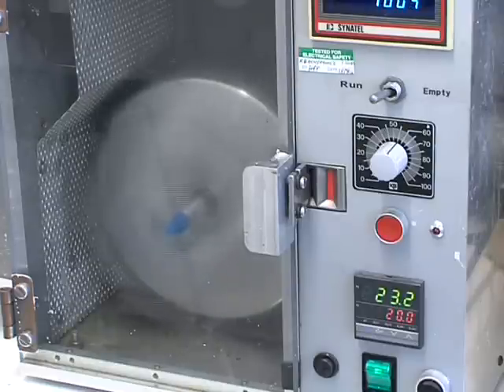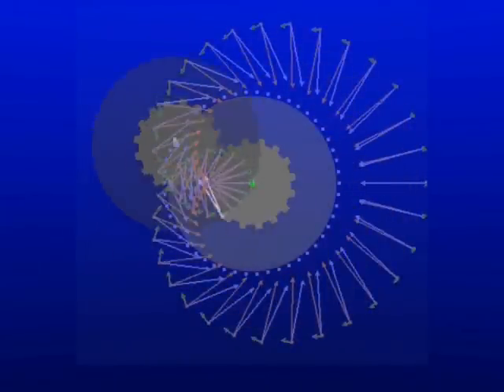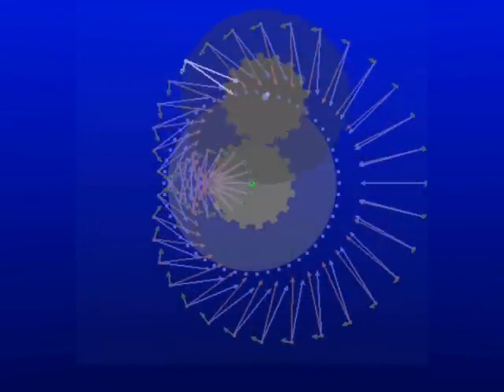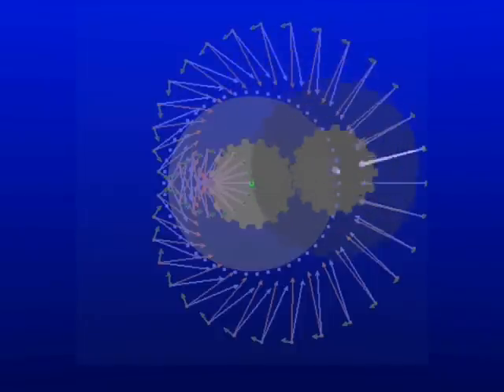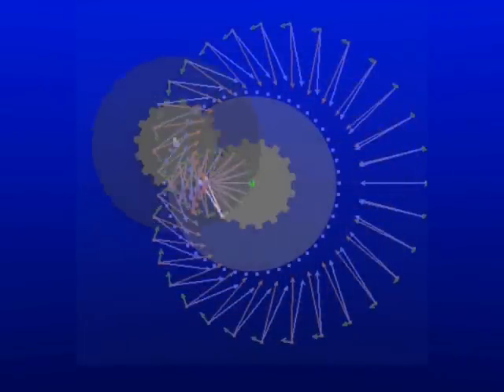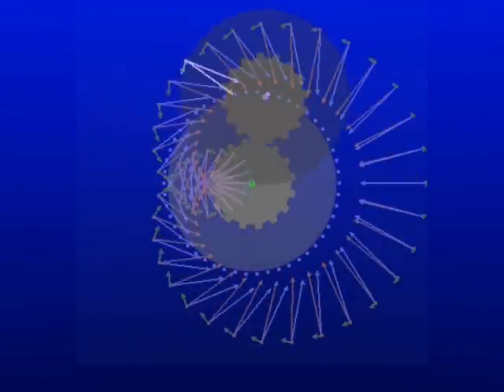In countercurrent chromatography centrifuges, tubing is wound in a coil onto a drum, called a bobbin, which is rotated in planetary motion. That is to say, the bobbin is revolving around the central axis of the sun gear, while simultaneously rotating about its own axis at the same angular velocity.